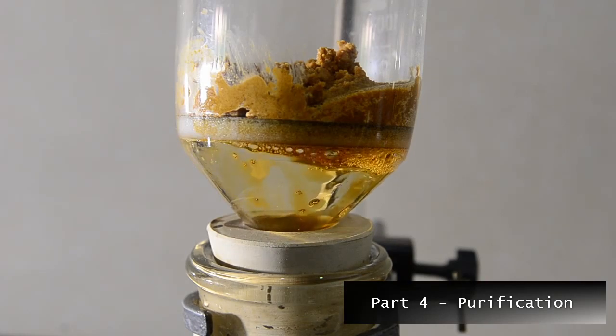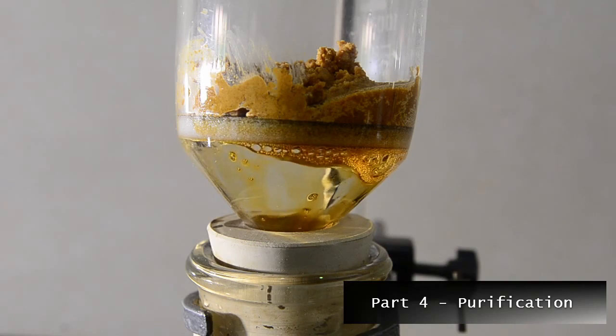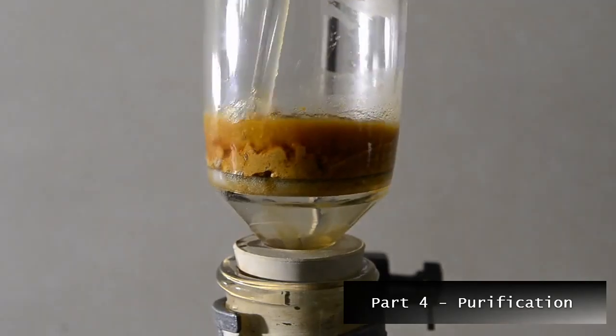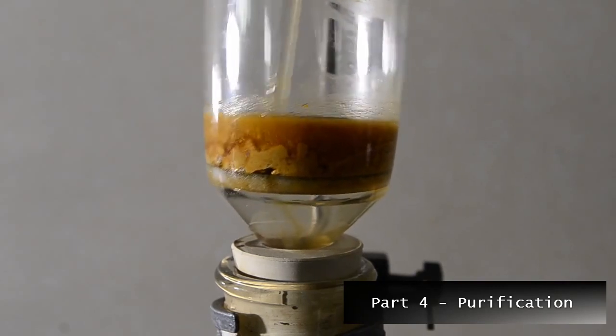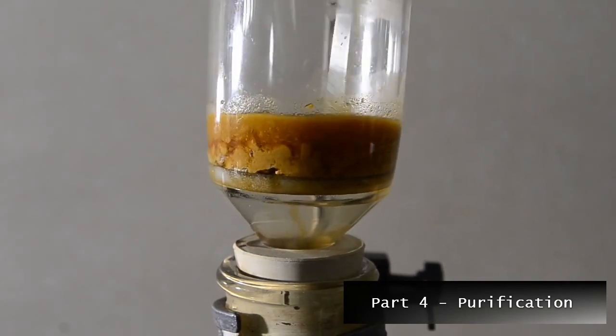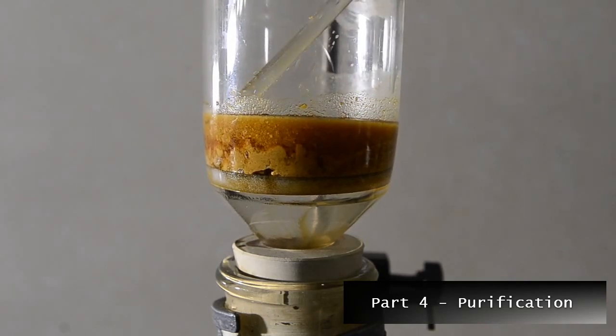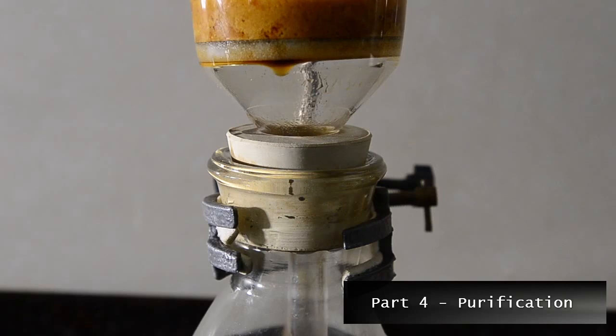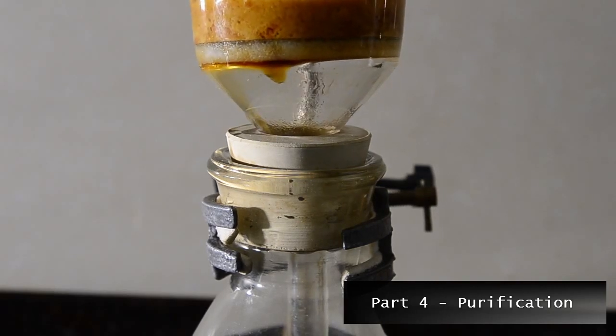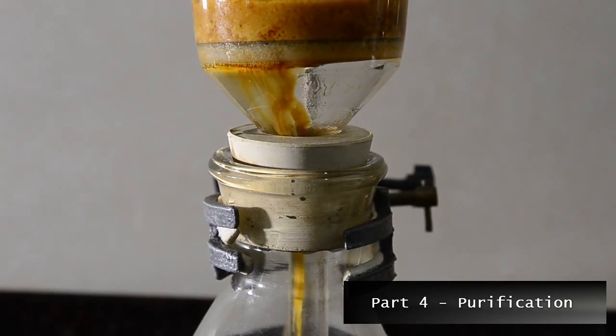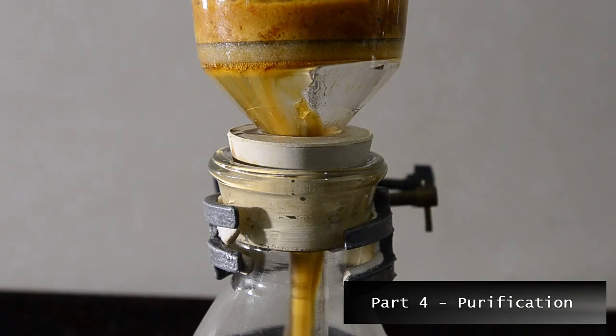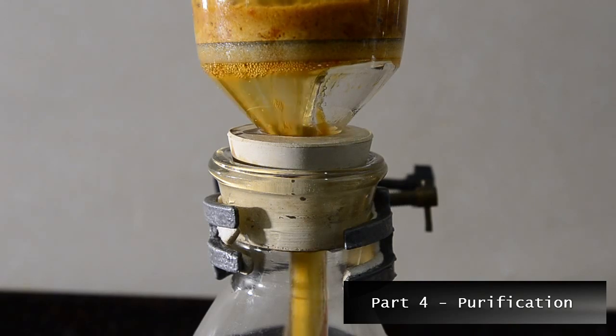It turns out that mandelic acid is not soluble in cold chloroform, so we can use this to get rid of some of the organic impurities. Add 15 milliliters of cold chloroform and break up the solid in the funnel. Then turn on the pump again and dry the solid as much as possible. We're now left with a crude mixture of mostly inorganic salts and mandelic acid.